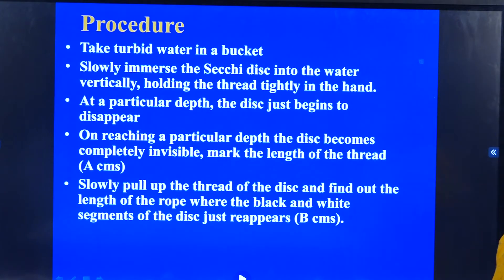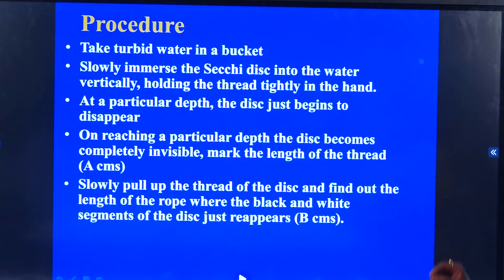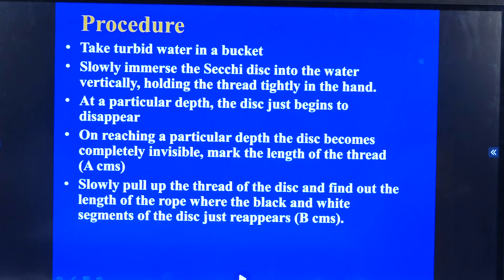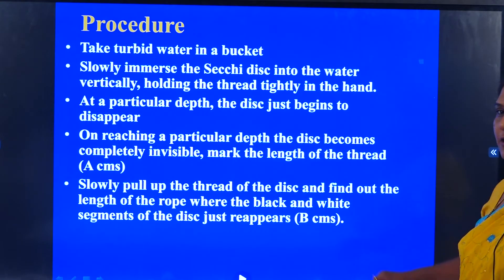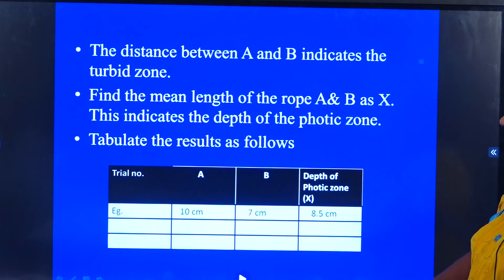The procedure is like this. You will have to take turbid water in a bucket. Slowly immerse the Secchi disc into the water vertically, holding the thread tightly in the hand. At a particular depth, the disc just begins to disappear. Stop there. On reaching a particular depth, the disc becomes completely invisible. Then you will have to mark the length of the thread there — that will be measurement A. Now slowly pull up the thread of the disc and find out the length of the rope where the black and white segments of the disc just reappear. That will be centimeters B.